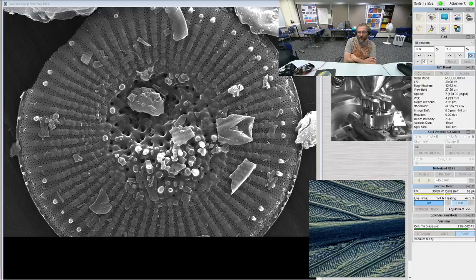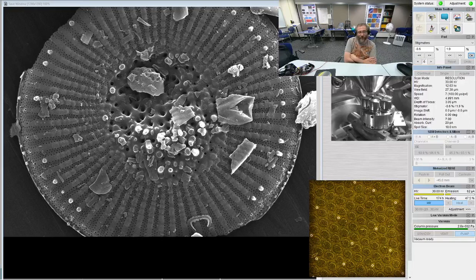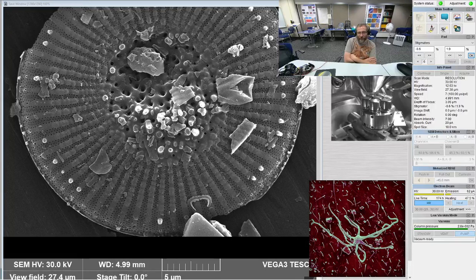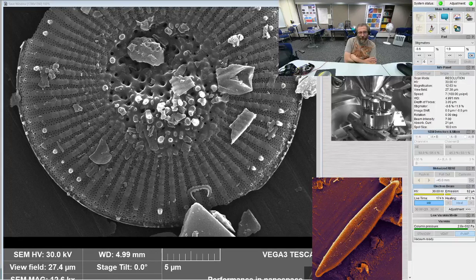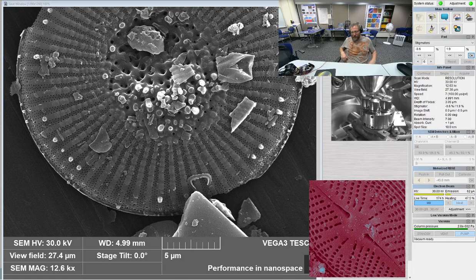It's Evolution, hello. Welcome in. We're looking at fossil diatoms that are 6 million plus or minus a couple hundred thousand years old from Nebraska. It used to be a Nebraskan diatom. Yeah, just 6 million. We've looked at 10 million. And I think I had some older stuff in here before. But I've got a bunch of... Yeah, no biggie. You know, 6 million, that's baby years in fossil land.